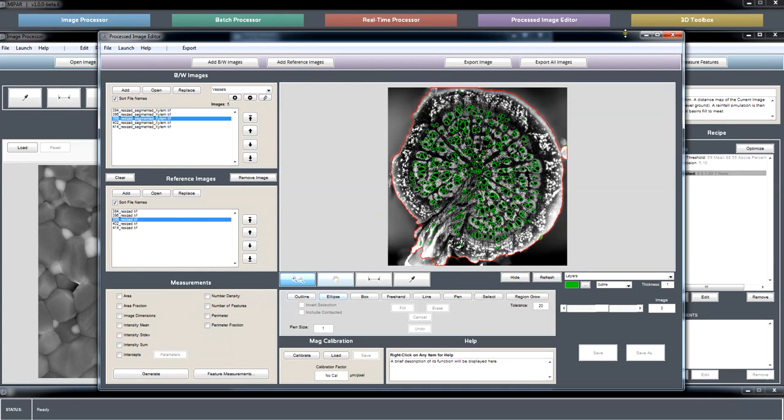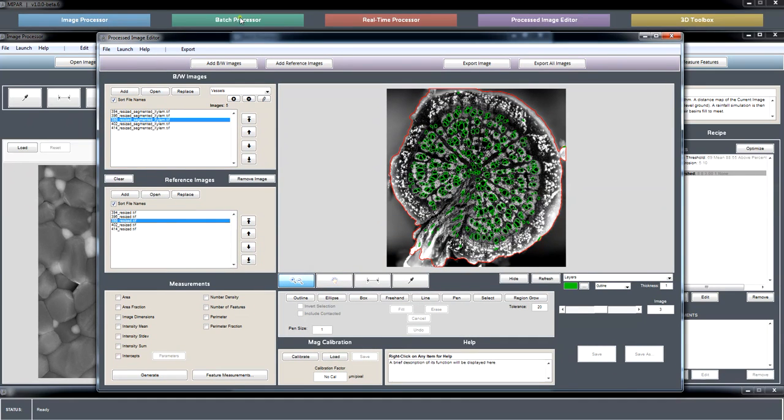I'm going to stop with the overview there, since I don't think we have a whole lot of 3D folks in the webinar. If there are some, I'll try to. One of the topics was making 3D workflows more efficient, so I'll show at least what a 3D workflow can look like, and then have you tell me if that's not efficient enough. Is there anyone here that is working with 3D data and wanted to see examples of that shown?